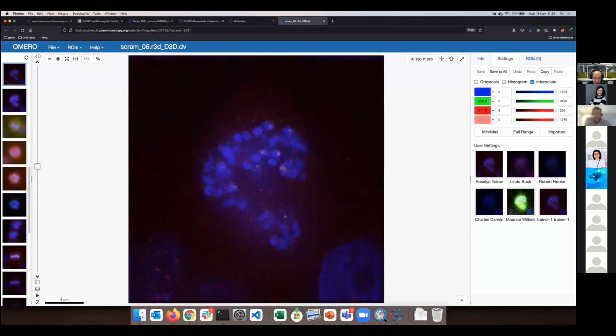It's a main full viewer. And I can now scroll through Z because this is a multi-Z section image. I can do it here from the office in Dundee, but you can do it from Turku. The images are still in Dundee, down the hill here, 300 meters from me in another building. I can do it from Singapore. My laptop can be in Singapore and I can still do what I'm showing you right now. You can do that with me, please.